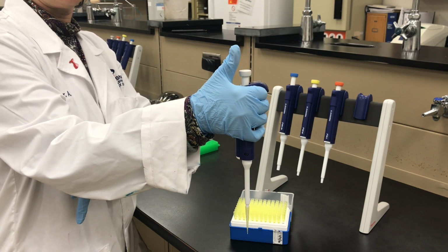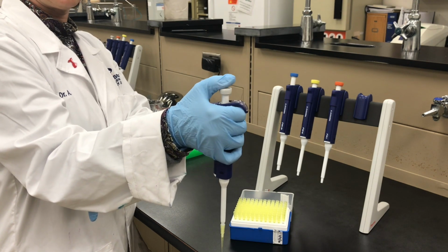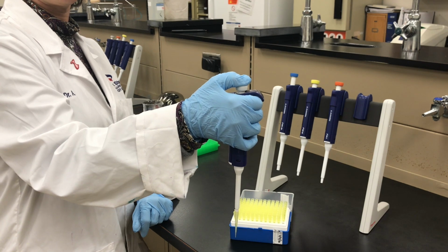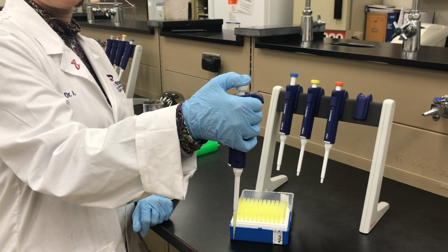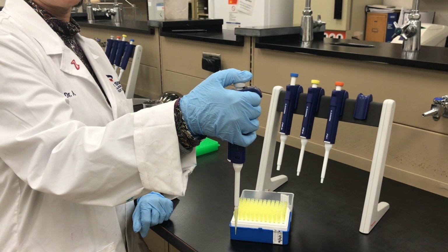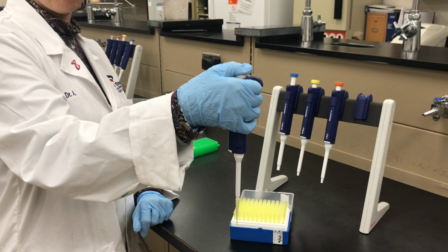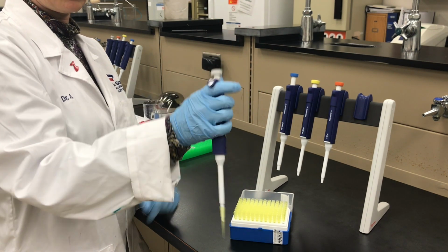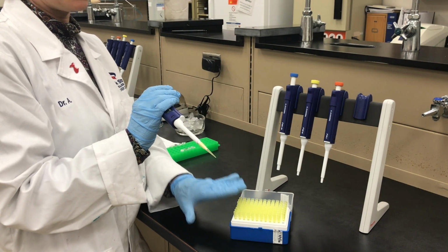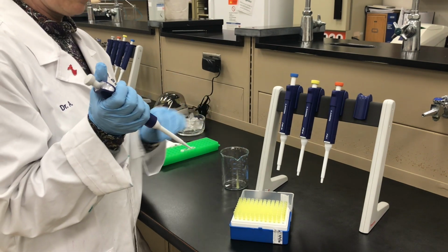Trickiest part is when you're going down, getting ready to suck up the correct volume, you go down to where the first resistance is. Okay, that's the hard part. So down to where you first feel that resistance, hold it there. But when you're spitting out, you go all the way down. Okay, so these are micropipettes, sterile disposable tips. We're going to have a trash beaker here. So things are going to go in the trash beaker.